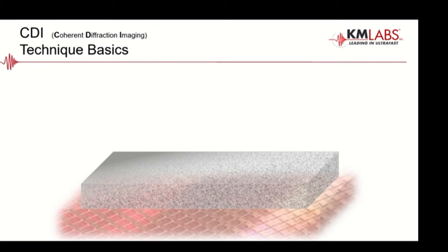And the way it works is in principle quite simple. We shine a coherent light source onto a sample, so we're of course using a laser beam in this case. And we can describe that with a few parameters. We've got some wavelength that those photons are representing, or some frequency, you could say. E in this case just represents the amplitude or the intensity of that light, and phi is the phase, right? So any wave propagating through space is going to have both an amplitude and a phase. And we're going to hit it on the surface of a sample at some angle, theta.